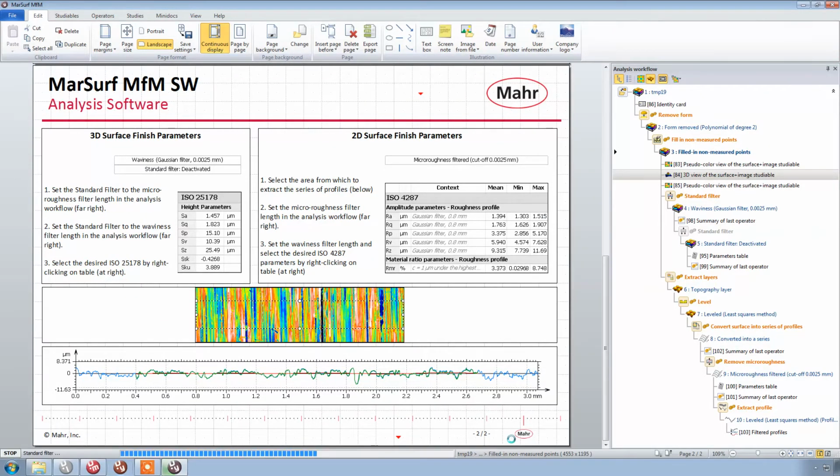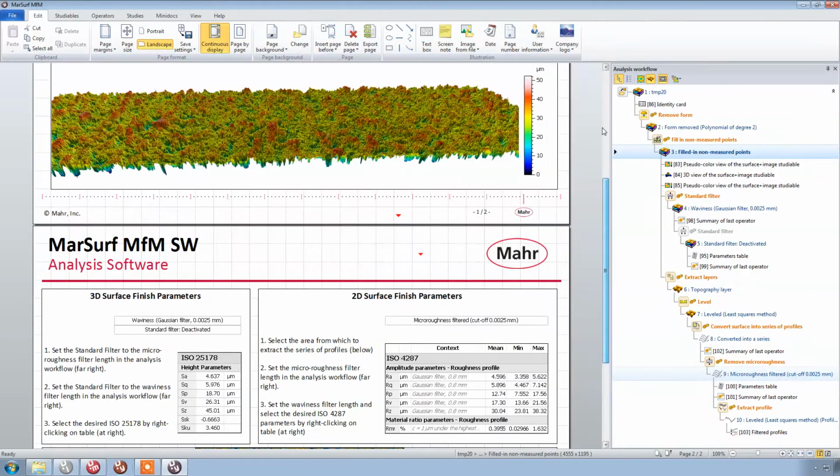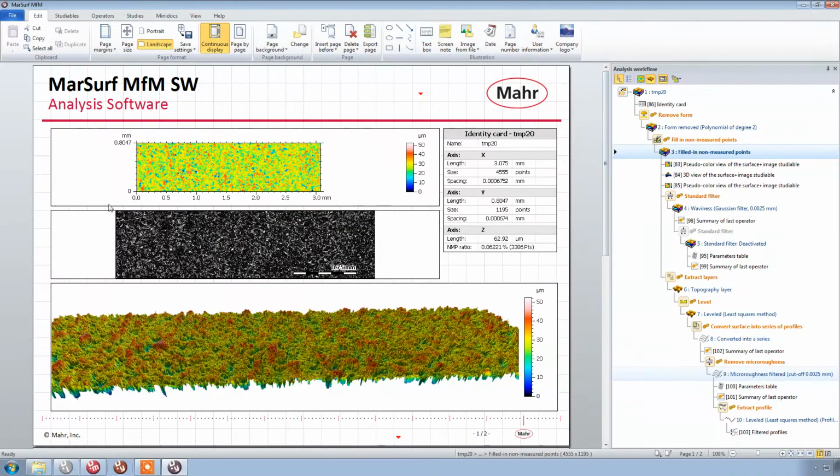So you'll see again, the blue status bar is moving. That means it's updating, doing all of the calculations. It's updating my report, and just there we saw it just updated. We'll go back up to the first page of my report. And again, it's the same exact format we saw before. It's just the new data set is in there.